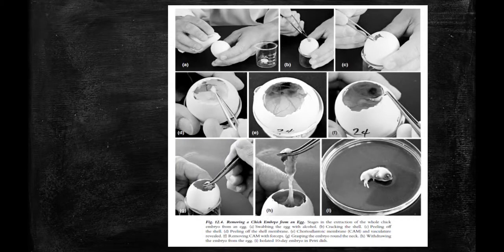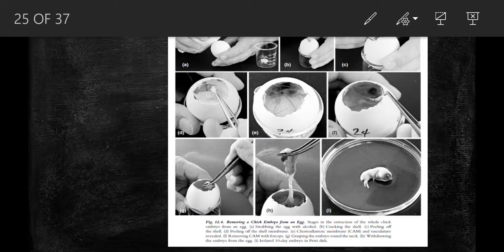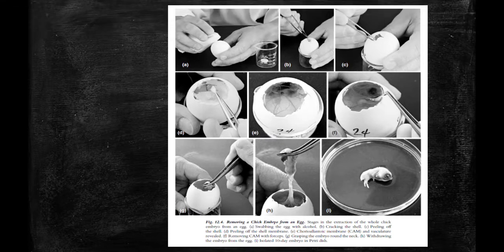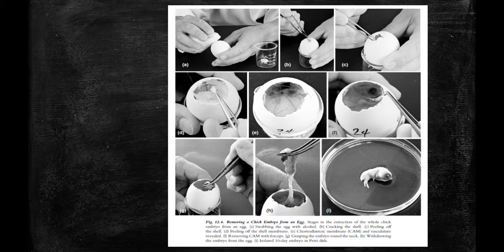So first, you have to incubate the egg at 38 degrees Celsius in a very humid atmosphere, then turn your egg 180 degrees every day.